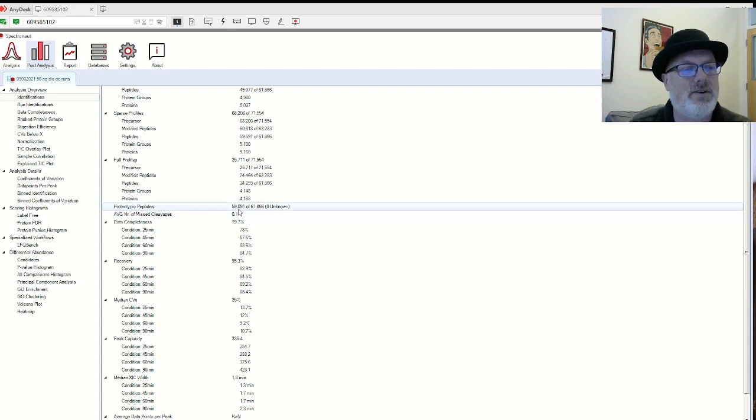We talked about one hit and two hit wonders, where we filtered away one peptide and just kept two. But there are certain peptides that are only specific to one protein group and some that are specific to more than one. We talked about this with protein inference too. But I believe that's the way the definition's used here. So this is a peptide that uniquely identifies a protein, I believe.